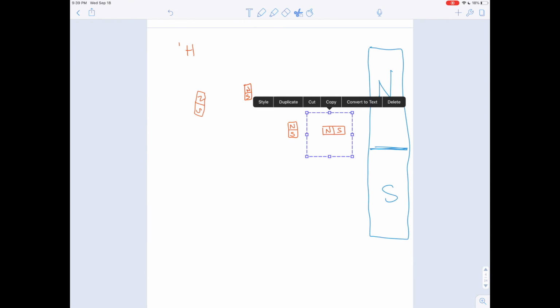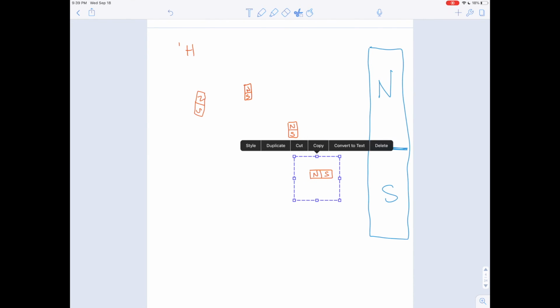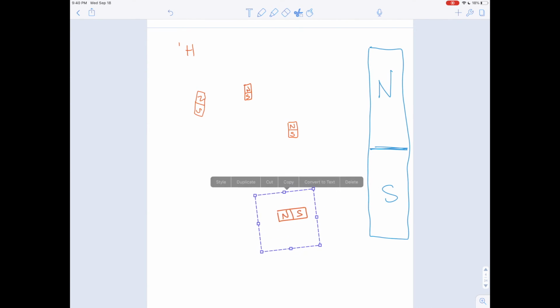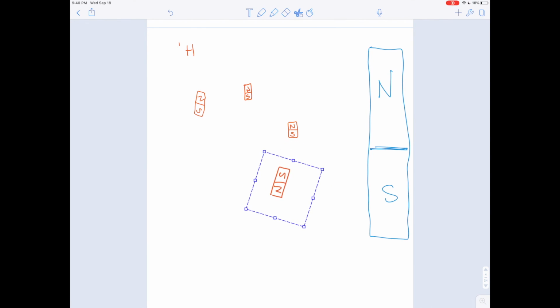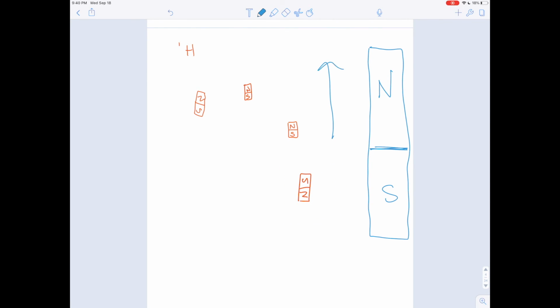But some of them, a little less, will have more energy. The nuclei are vibrating, knocking around, they've got more heat. For whatever reason, they have more energy than the other nuclei, and so they need a way to express that energy. The way they do that is that they go into an alignment that is opposite the magnetic field you're applying. Notice, we have this north side going here, so it's natural for these to have their south sides lining up with it. In other words, these are parallel to the external magnet we're introducing.